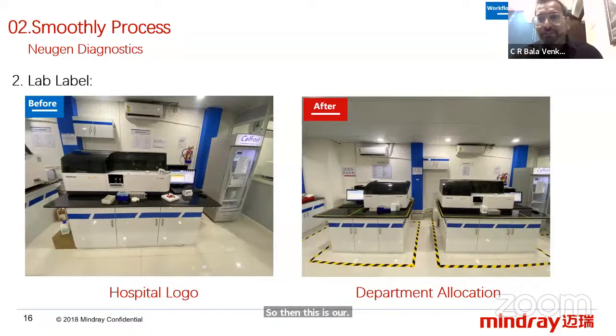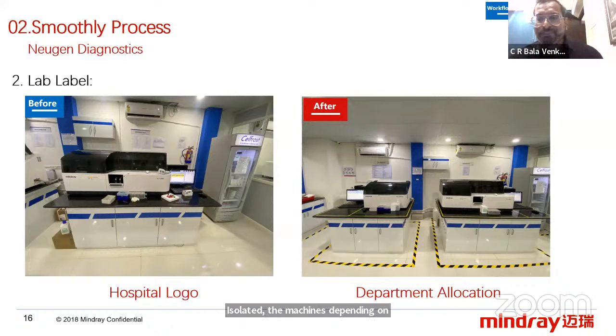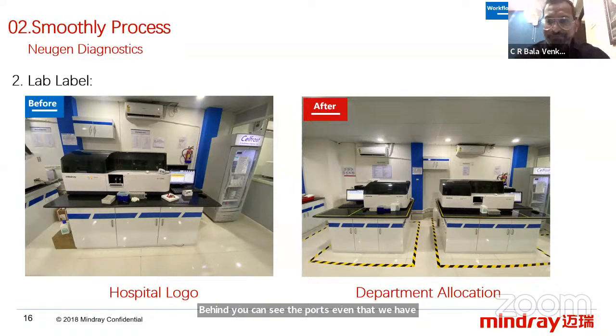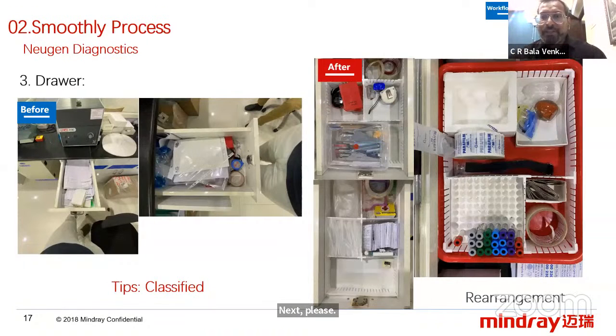As you can see, wherever it is, it was not properly mentioned. Behind each machine, we have isolated the machines based on the departments. You can see that department allocation was done, and we have provided them the list of tests being run in that laboratory by the instrument. So behind that instrument, we have given, you can see, the boards that we have designed for them. Next, please.